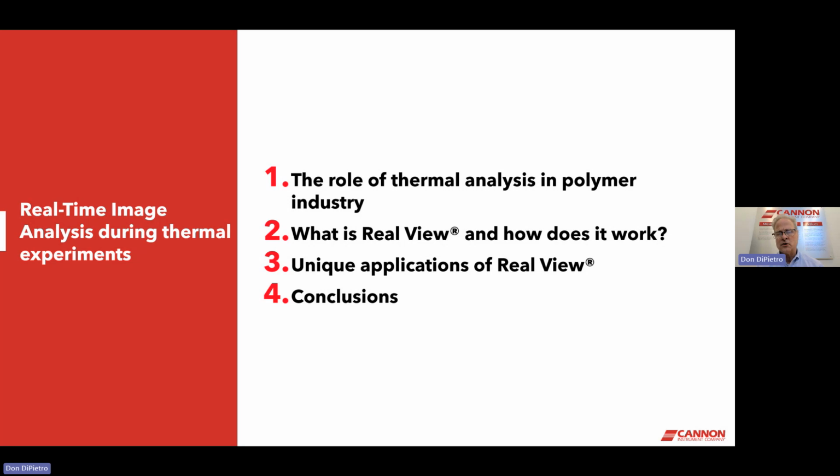And we coined the term RealView just for marketing purposes. So when I use the term RealView, please think image analysis. And as I said before, the thing that's exciting about this is the coupling of things being unique and important. Sometimes they don't always couple together, and you have some features that aren't so important.